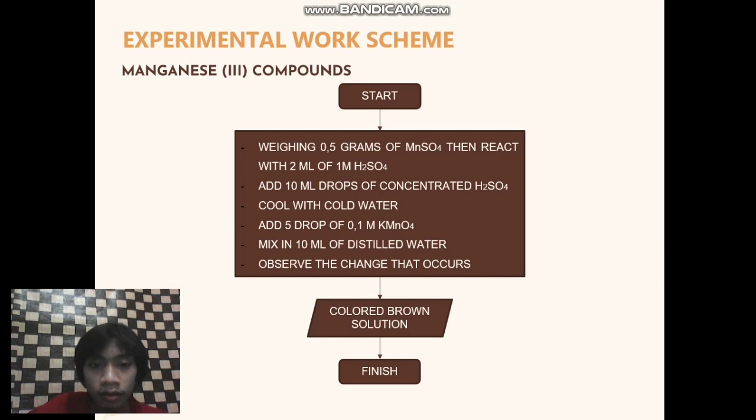Add 5 drops of 0.1 M KMnO4 and mix in 10 ml of distilled water and observe the change that occurs. The result is a brown solution, and finish.